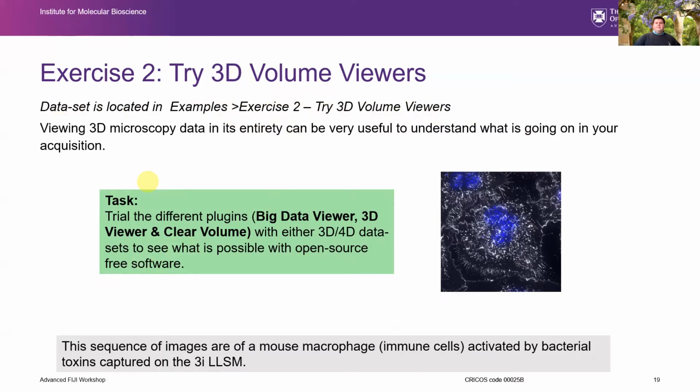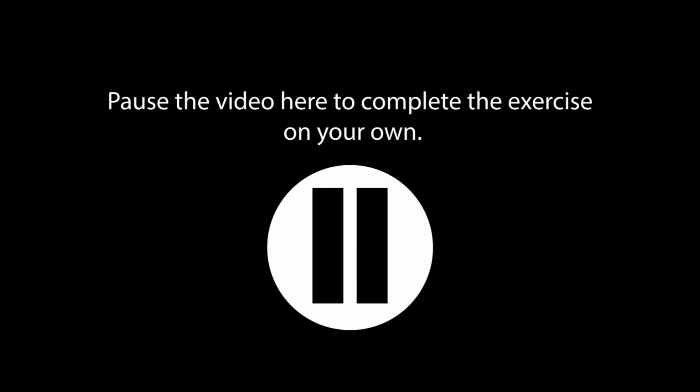Again, pause the video if you want to try this on your own, or I will lead you through it as well to show you some things. So the task would be to trial the different plugins, and see what's possible with the open source and free software.